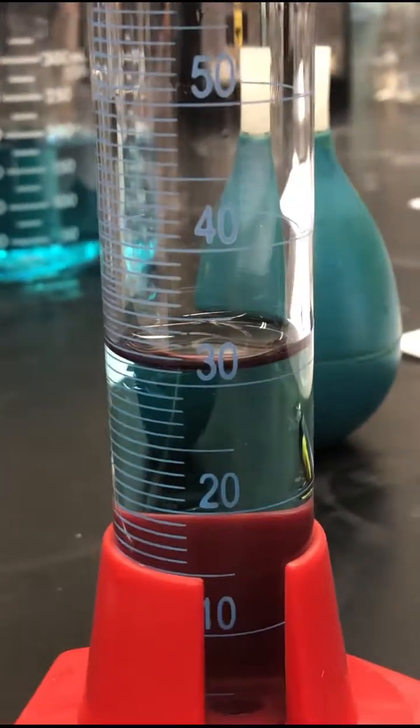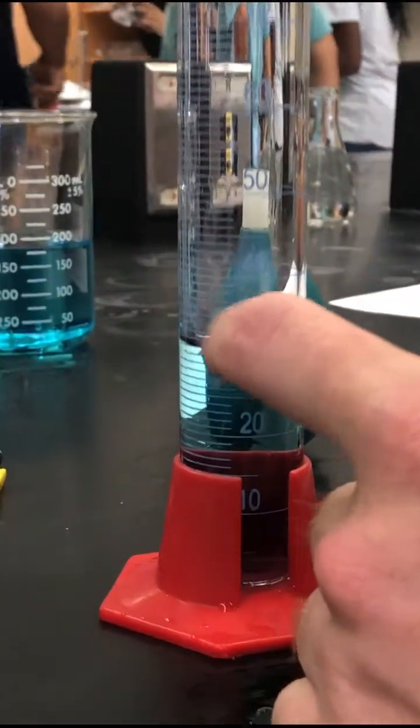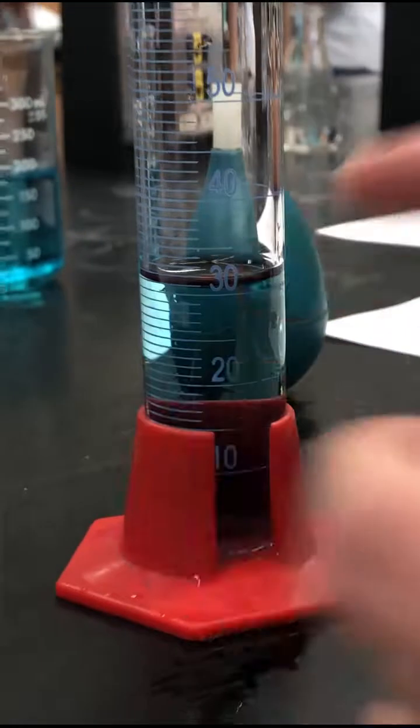So basically, meniscus is how that little dip happens, and it looks like it's kind of like a U shape, and this happens because the water molecules are actually attracted to the container more than they are to themselves, so it creates this little U shape.